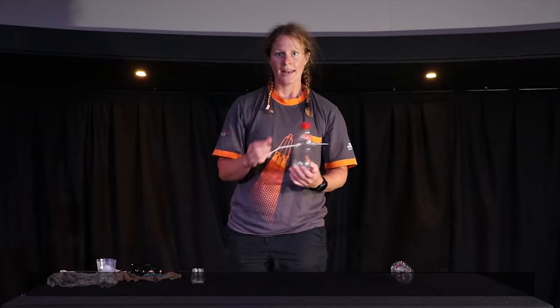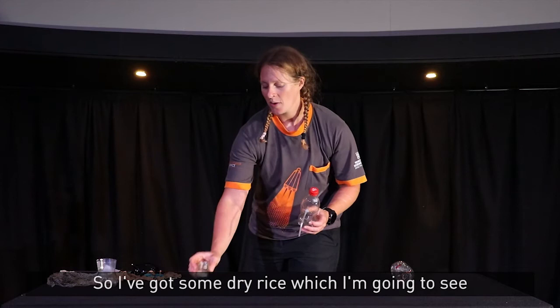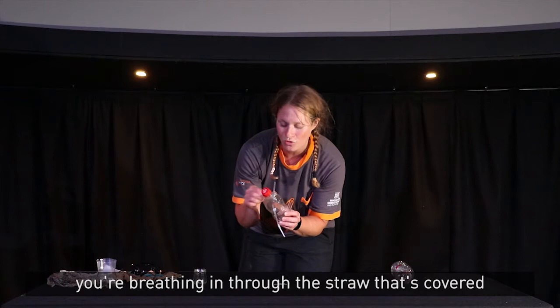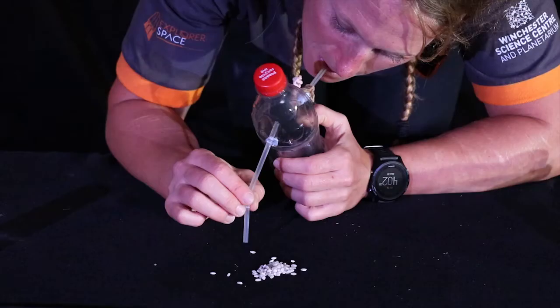Now, before you take it outside, it's always good to check that your equipment works. So I've got some dry rice, which I'm going to see if I can capture into my pooter. Now make sure when you're testing this that you're breathing in through the straw that's covered in the tights, or you'll end up with bugs to the back of the throat.